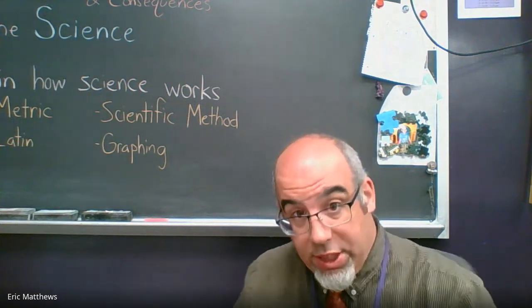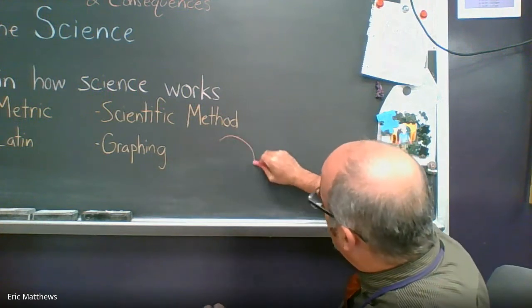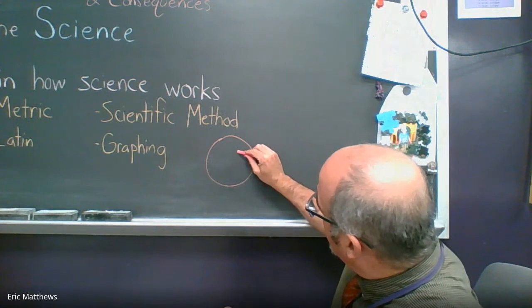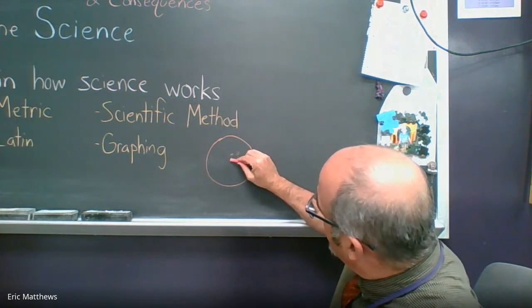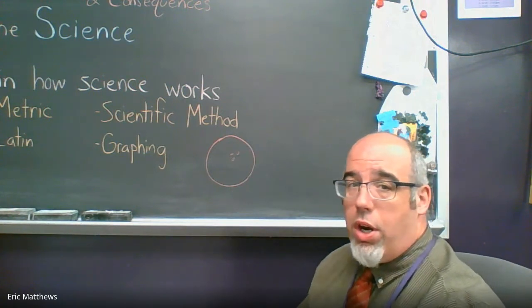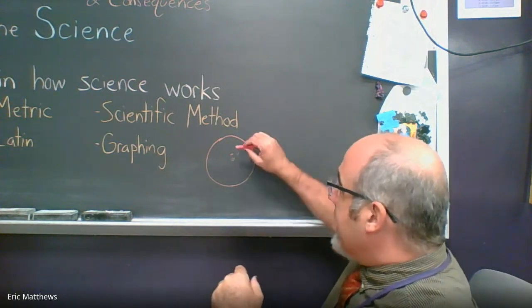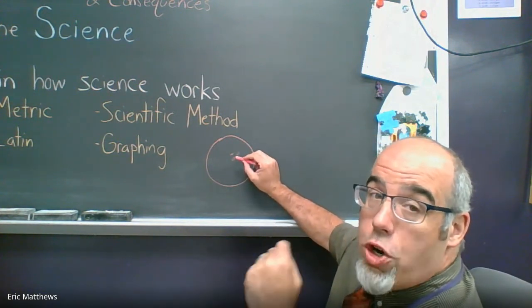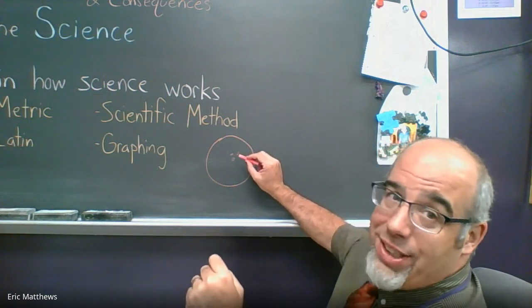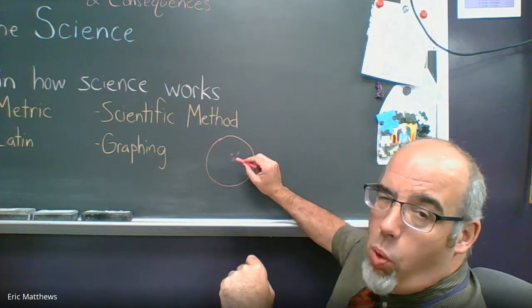Now, what you're going to see under low power is going to be relatively minor. In that circle, you're just going to see little things. It's going to be very hard to make out any kind of detail on it. One thing to watch out for is if the little things you're looking at are dark brown or black in color, then that's not cells, that's food.